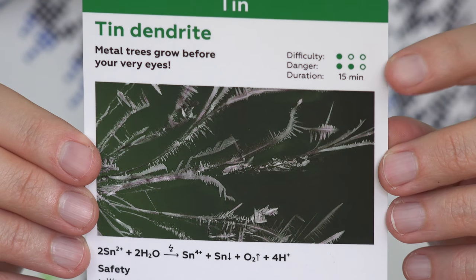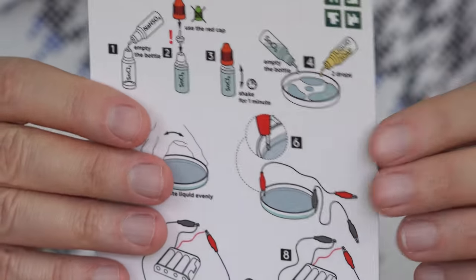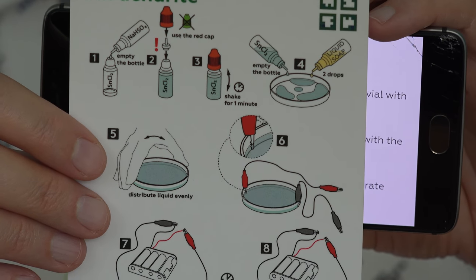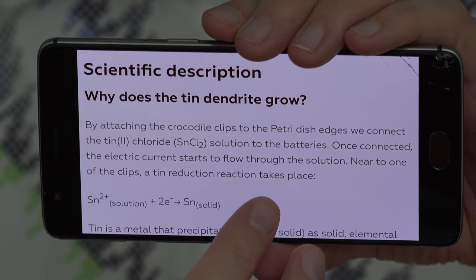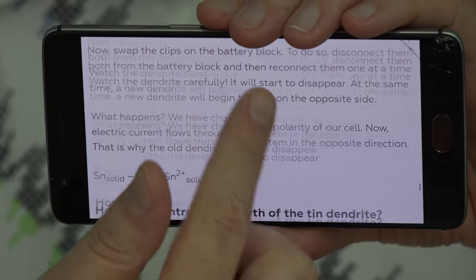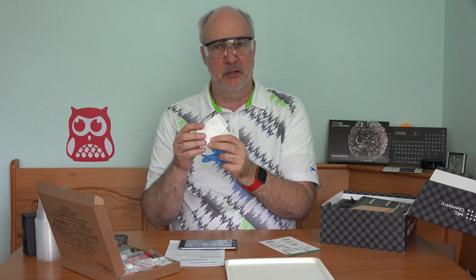Metal trees will grow right before my eyes. It's low difficulty, moderate danger, and you should have kids 12 and older doing these experiments with a parent or adult there to supervise. Rather than deciphering the graphics, you can read the instructions in the app — they give you information about what you're actually seeing, what's happening and why. There are also different tweaks you can do to run the experiment a different way for different results. In this experiment you need to wear gloves — you don't want to get the reagents on your hands. They include gloves in both large and small sizes.